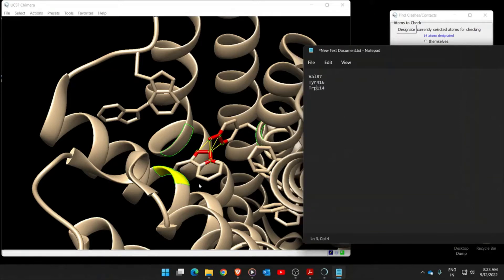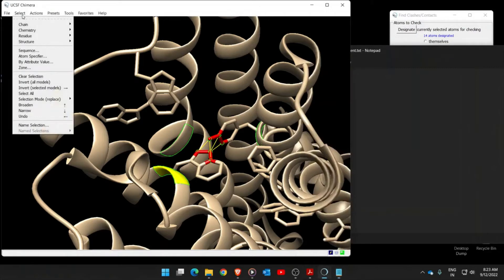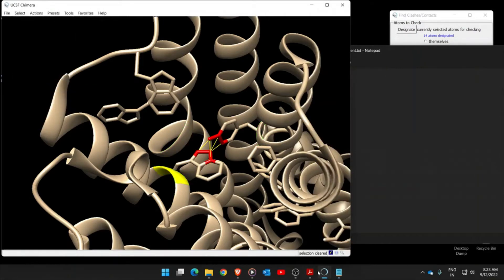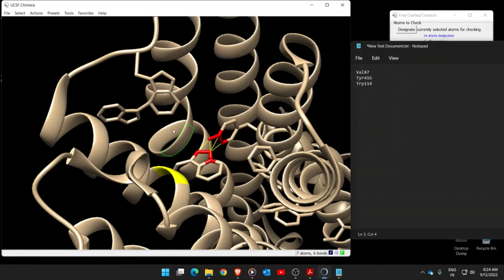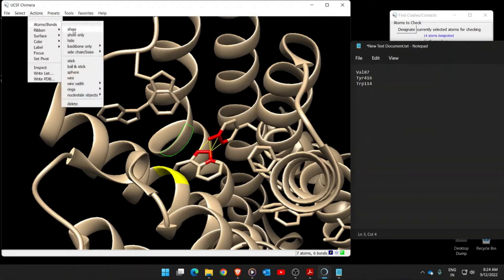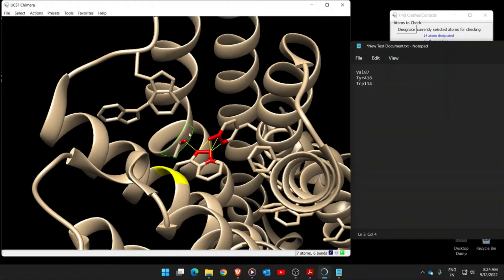Now select all three amino acids. Go to Clear Selection first. We need to select Valine 87, Tyrosine 416, and Tryptophan 114 one after the other. Hover the cursor to find Valine 87, press control and left-click on it. Then go to Actions > Atoms/Bonds > Show, which will display the side chain of this amino acid.